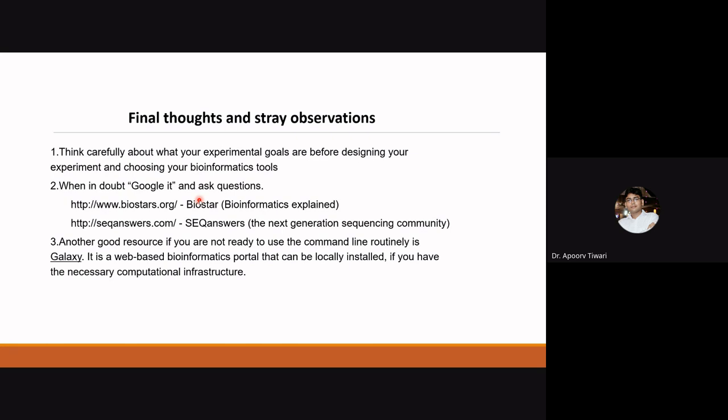There are whole annotated genomes in FASTA format, as well as GTF and GFF files. So if you have designed your experiment on plants such as Arabidopsis, rice, maize, or wheat, reference genomes are available.